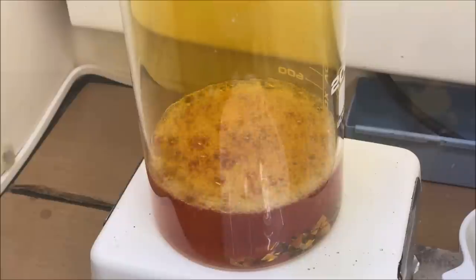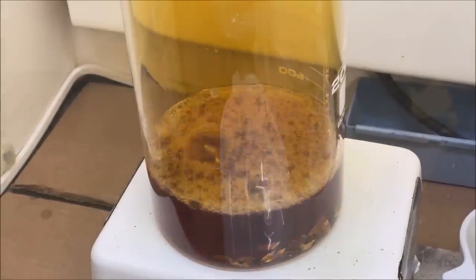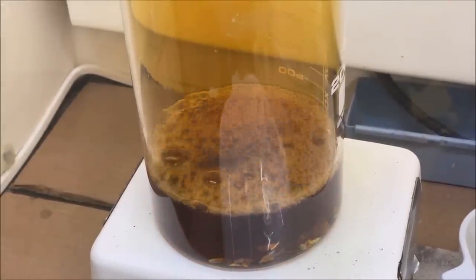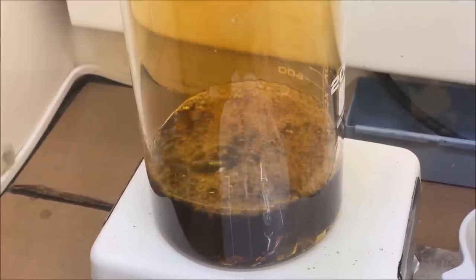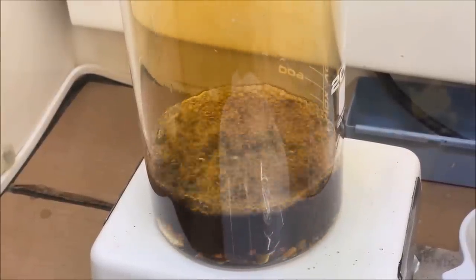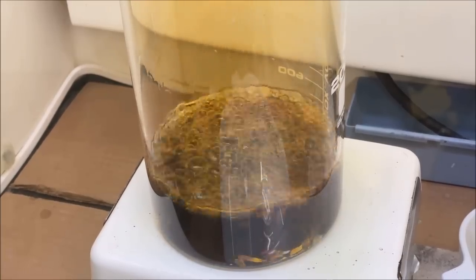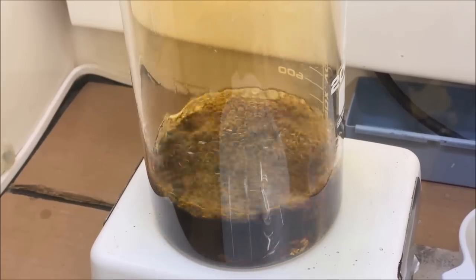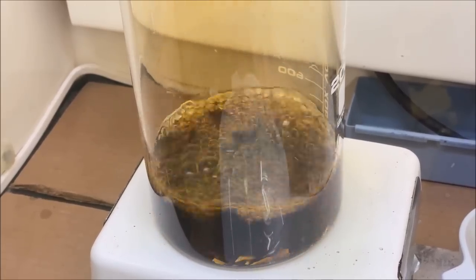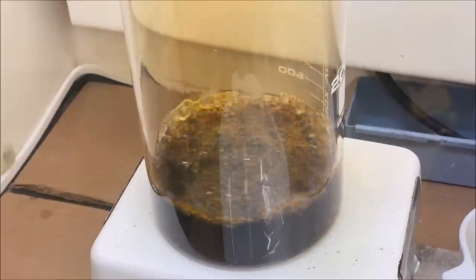This is about a half hour time lapse. You can see the platinum metal down there dissolving and getting smaller as the aqua regia puts it in solution. But it's going to be very difficult to dissolve 100% of this metal. At some point, it's going to be diminishing returns, and I'll just leave a little bit of residual metal in there undissolved.